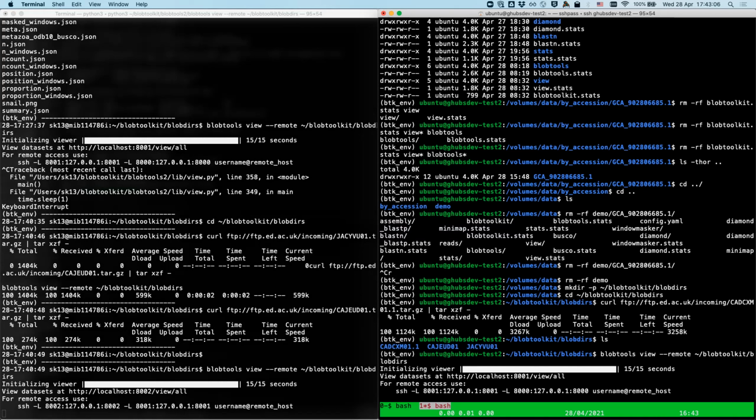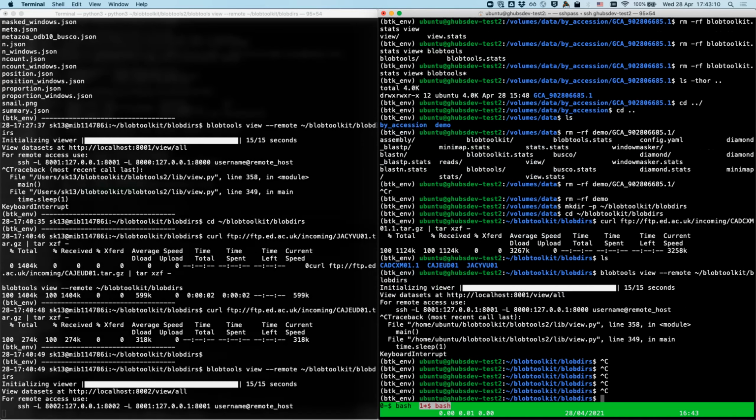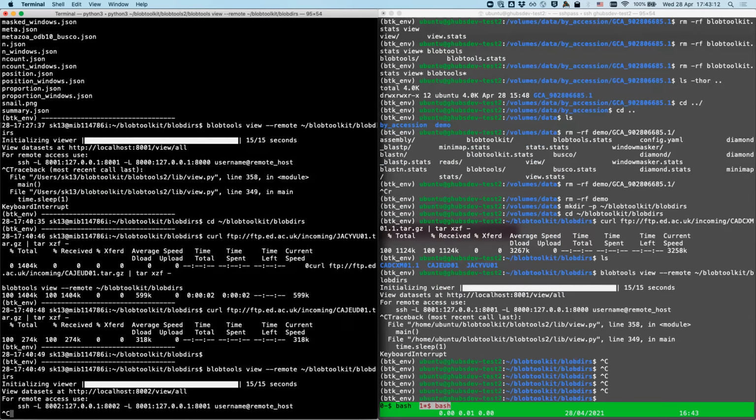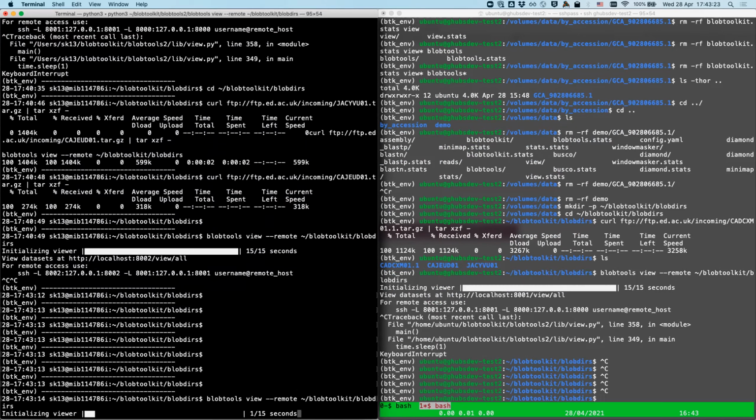It's my fault. I will kill that on the server and run it only on the local machine. And this time I'm going to wait for a few seconds, which is always a good idea. Hopefully it will work fine. It's because I was running it on the server, on a remote one, and on a local one, and the 2 ports clashed. So run it on only one thing, you'll be fine.